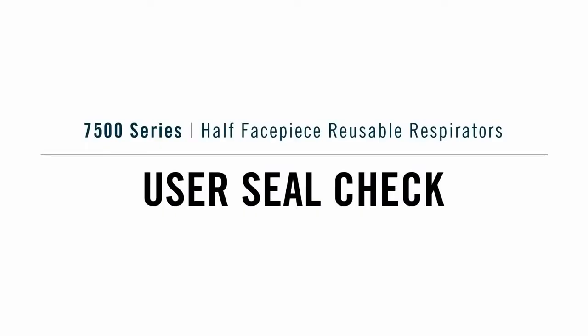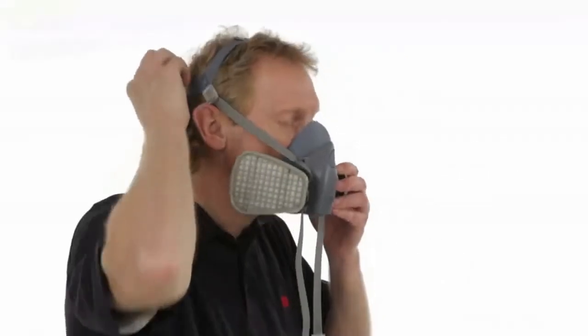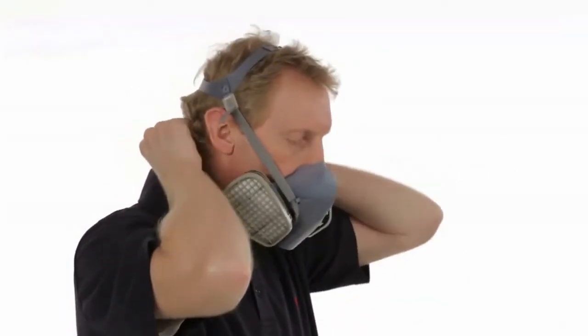User seal check. Always check the seal of the respirator to your face before entering a contaminated area. You must perform either a positive or negative pressure user seal check.